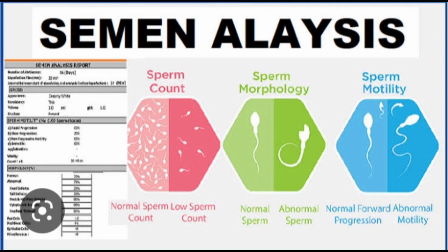Result. The complete absence of spermatozoa, azoospermia, should be confirmed after centrifugation of the specimen. Only a few motile spermatozoa are present, oligospermia. The spermatozoa are present but immobile, necrospermia.